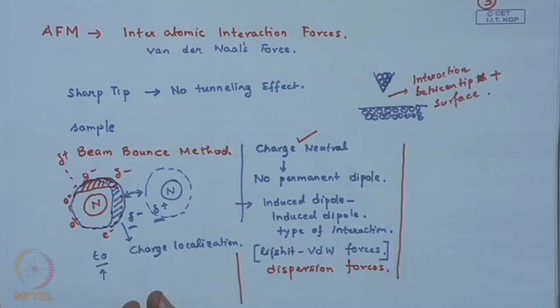What is important to realize is that though this is the most fundamental form of force, in our macroscopic world we hardly see the signature of van der Waals force, and everything we see is dominated by gravity.